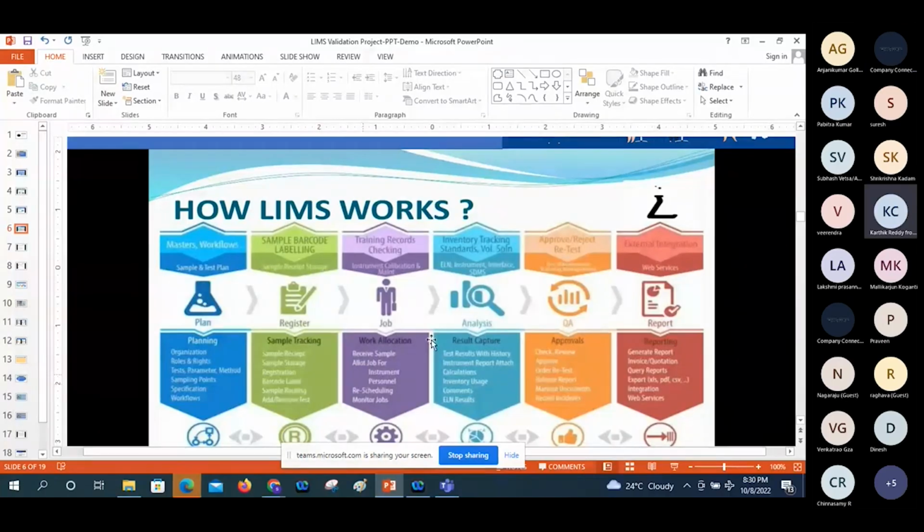Training records are generally handled in the analyst qualification module that we have in the LIMS application. For example, once a new joiner joins the quality control laboratory, whether experienced or a fresher, they can assign one person to the new joinee. As part of the analyst qualification SOP, the internal in-house SOP, they can give the training to the analyst. At that time, the analyst qualification is also available in the LIMS, so he can do the training everything in the LIMS.